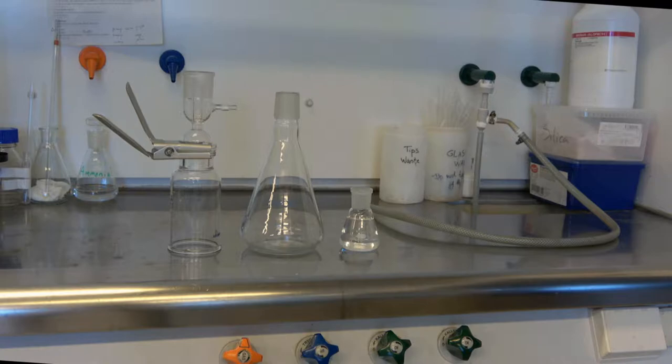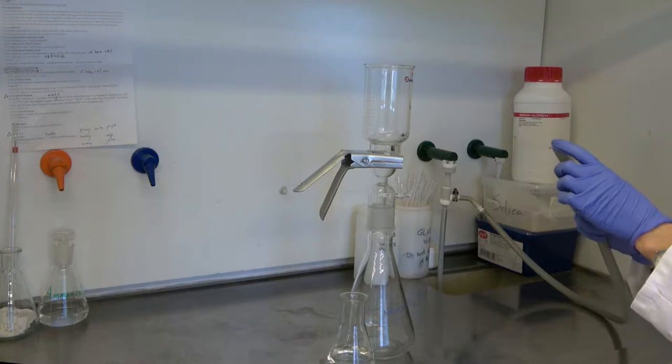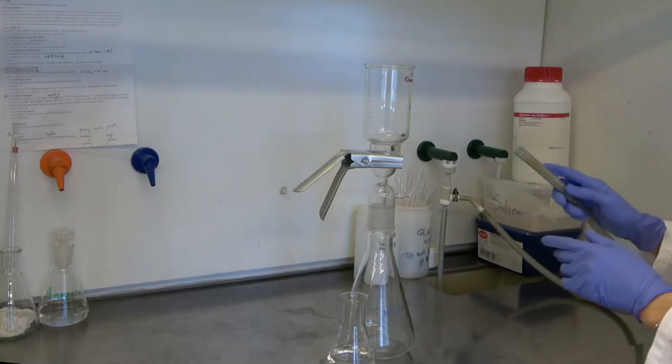The filter glass is placed on top of the collection flask. The water pump is turned on and once the vacuum can be felt, it's connected to the nozzle of the filter glass.